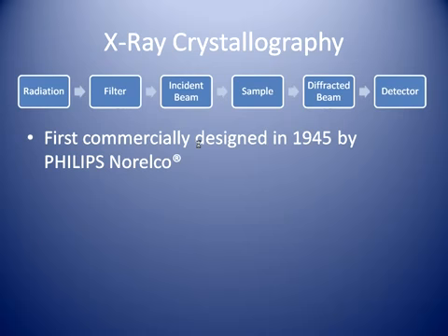What I'm going to do right now is show you the schematic flow diagram of X-ray crystallography, and I'm going to go through each component of X-ray crystallography and explain exactly what they mean. It's important to note that X-ray crystallography was first commercially designed in 1945 by Phillips and Norelco.